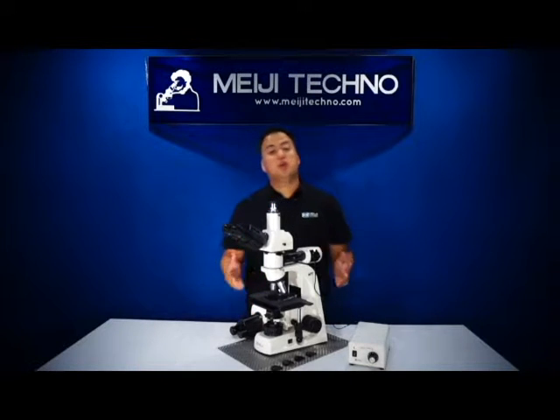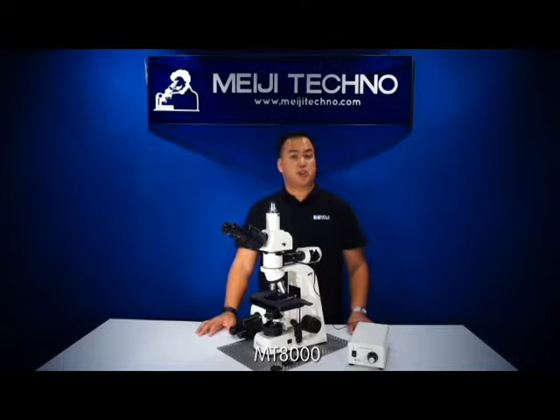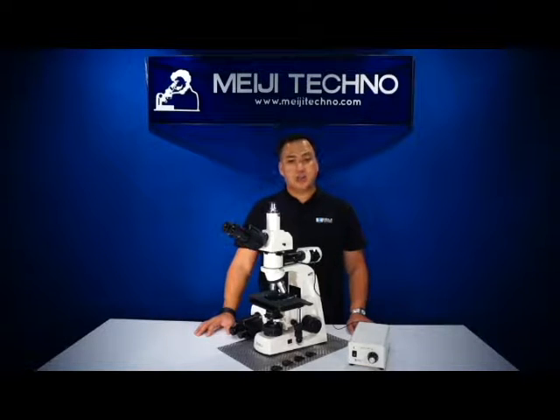Ohayou gozaimasu. Welcome to Meiji Techno. Today we'll be discussing our MT-8000 series Metallurgical Reflected and Transmitted Light Brightfield and Simple Polarization Compound Microscope Series. Our MT-8000 series is our most popular upright brightfield metallurgical microscope with newly designed Plan Acromat Epi Infinity Corrected Optics, and it's 100% made in Japan and comes with a limited lifetime warranty.